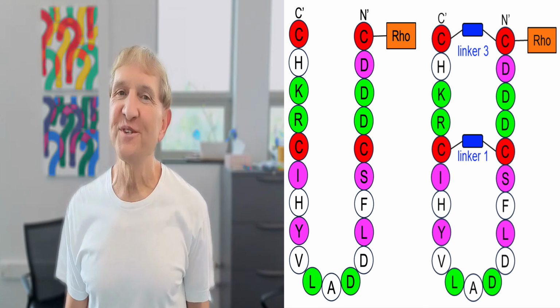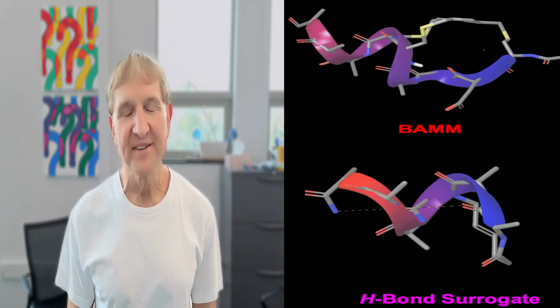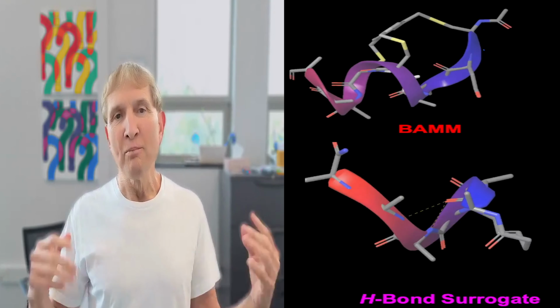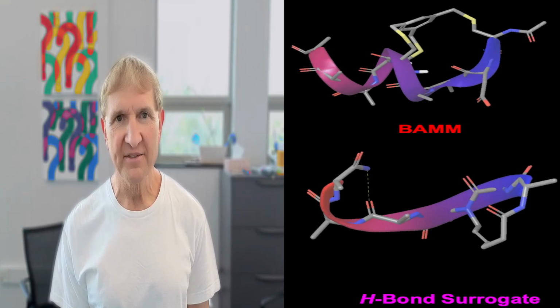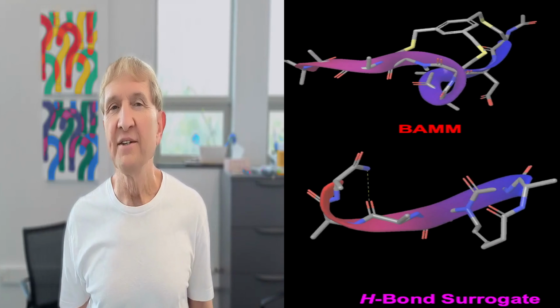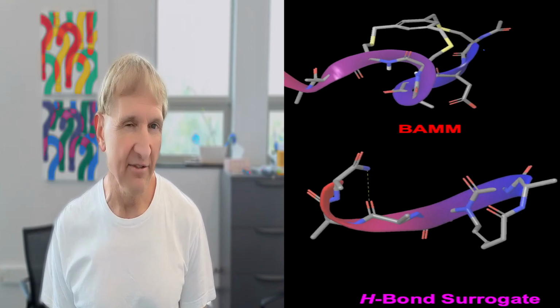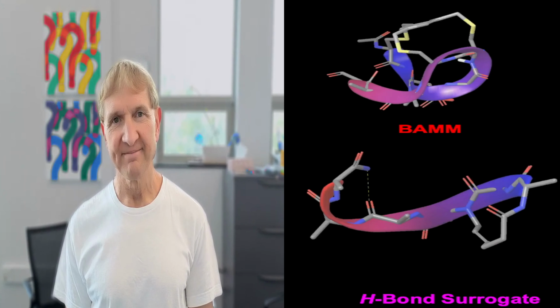There's a lot more to peptide synthesis. I haven't told you anything about the protecting groups. I haven't told you about other methods like the more old-fashioned Boc approach. That's got a big disadvantage relative to the FMOC approach insofar as to cleave from the resin, typically, you need HF, a very corrosive, unsafe reagent.